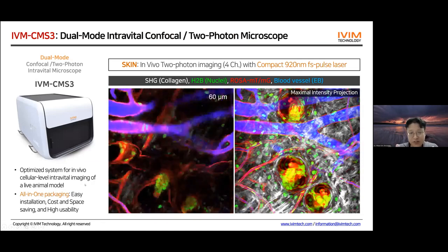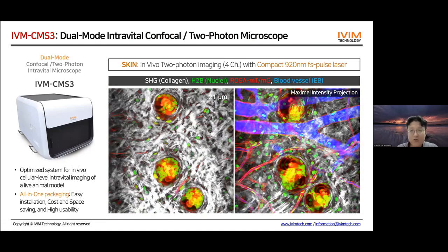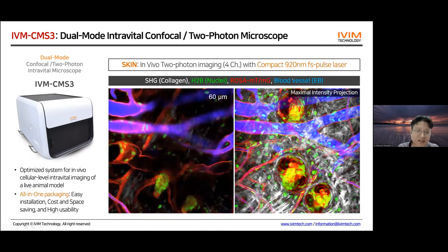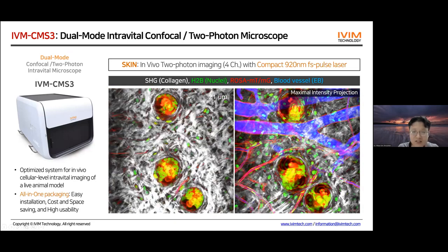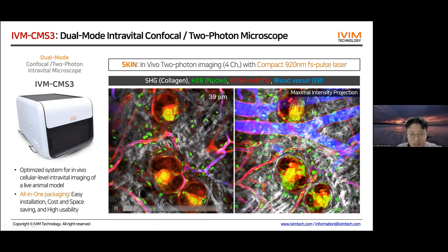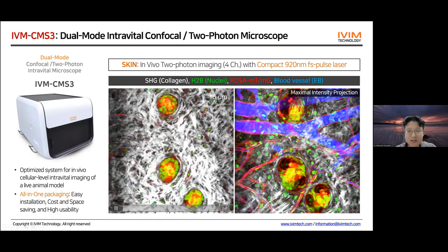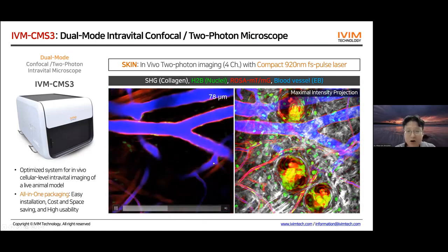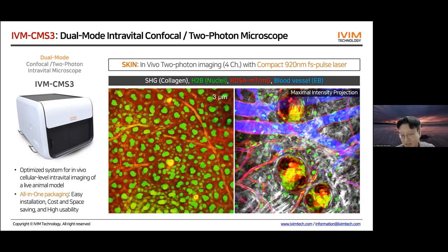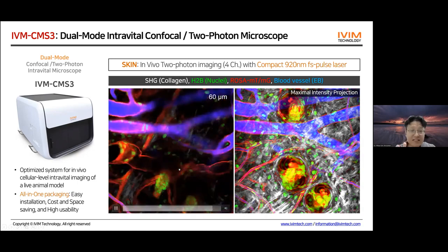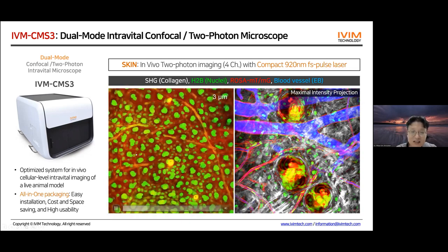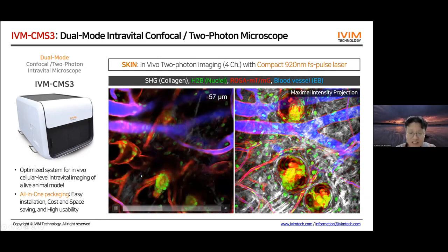Here is a four-color simultaneous two-photon imaging result from the skin using our femtosecond pulse laser system. This is z-stack data: green is H2B-GFP from nuclei, red is Rosa26-membrane-tdTomato from all other cells, and white is collagen visualized by SHG signal. We can nicely see fluorescence signal from the nuclei and cell membranes together with dermal collagen in the skin.